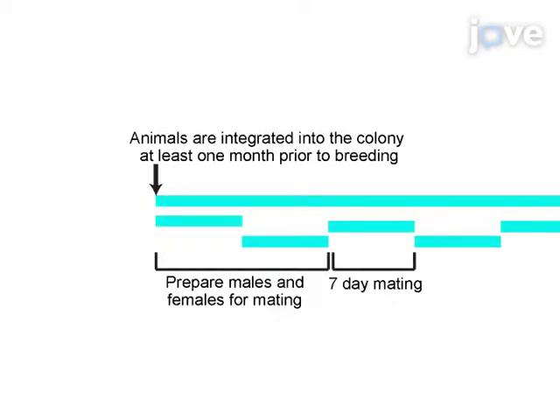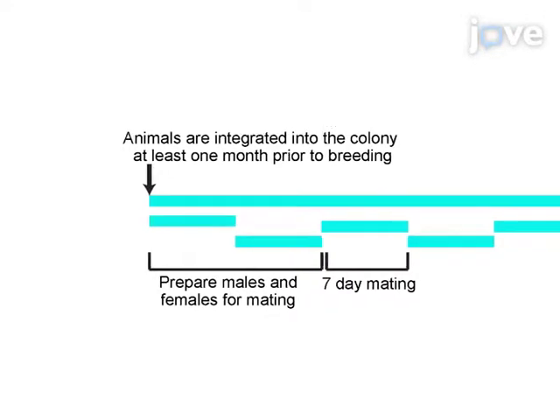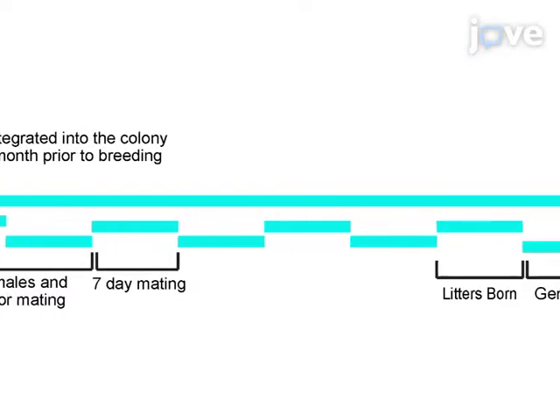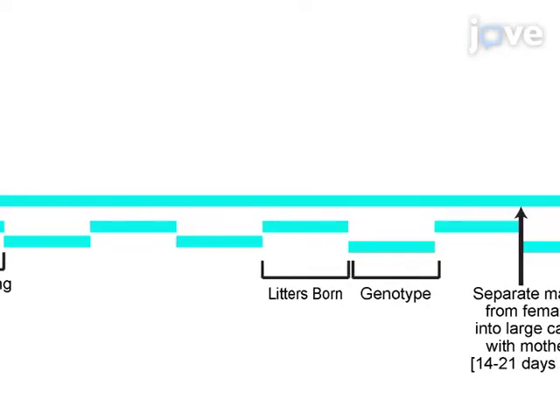In mice, environmental enrichment is known to improve lifespan and tumor wound repair. To define the role of microbiota in this phenotype, breeding animals were integrated into the mouse colony for at least 1 month to normalize the microbiota. Then, they were bred, and their progeny were raised in an enriched environment or a normal environment. The progeny were also tumor-bearing or wild-type.